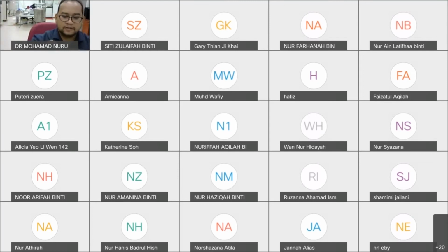Okay. So please circle any experiments here. We already state here. Circle, and we already have a default setting. But if we need more time to measure, please mention in this box. For example, the default for carbon is around 1 hour. Your experiment needs 3 hours. Just write down carbon 13 here, 3 hours.